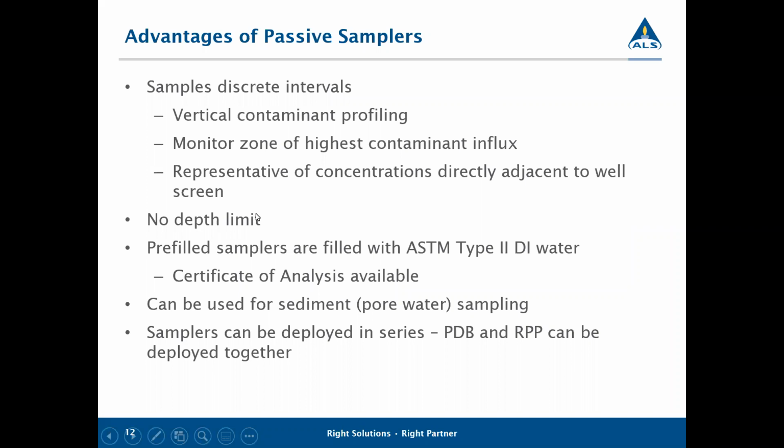These passive samplers don't have any depth limit either that we have to worry about. They've been used all the way up to 1,000 feet wells. No depth concerns. The only concern is, you know, making sure that it stays in that screened interval. And I touched on that with, you know, you may want to consider an additional stainless steel weight to make sure that it is staying there, especially if you have an especially deep well.